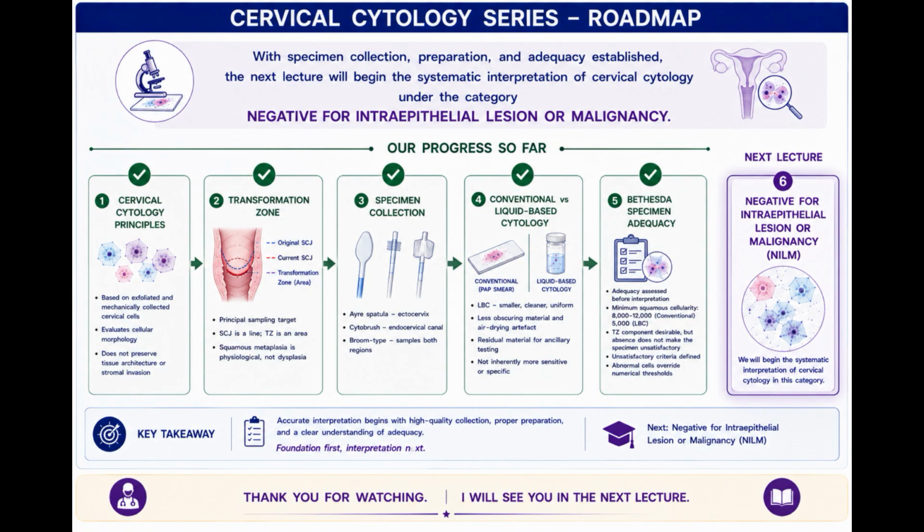With specimen collection, preparation, and adequacy established, the next lecture will begin the systematic interpretation of cervical cytology under the category negative for intraepithelial lesion or malignancy.